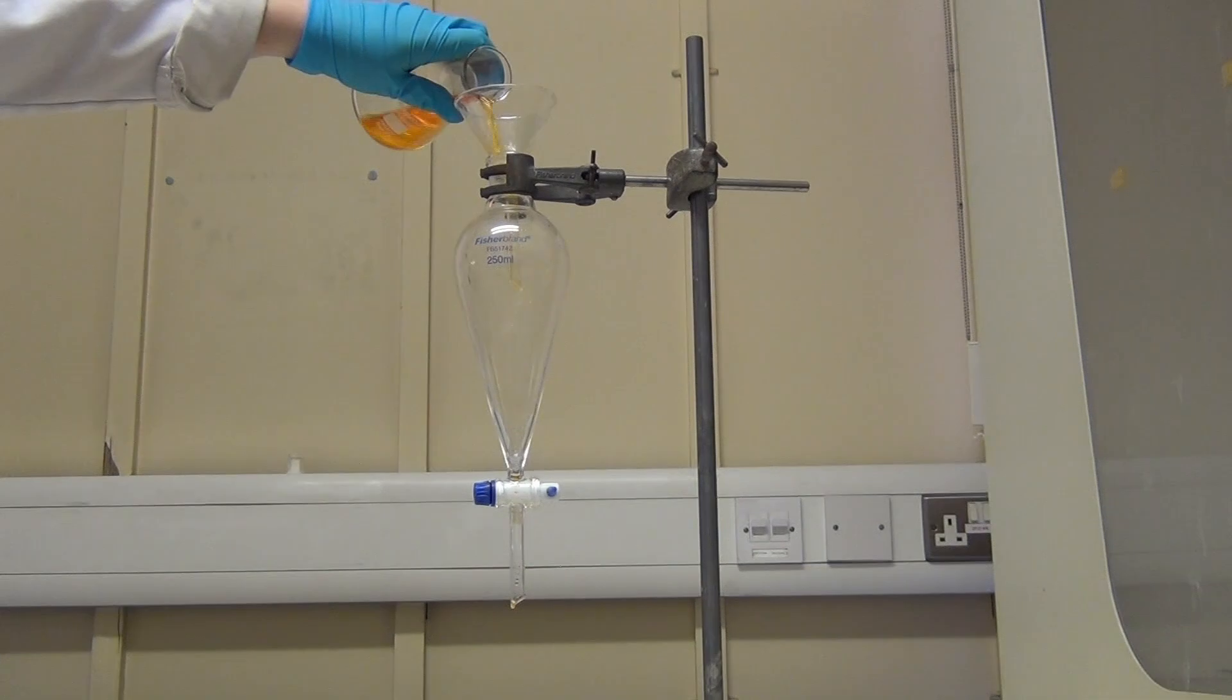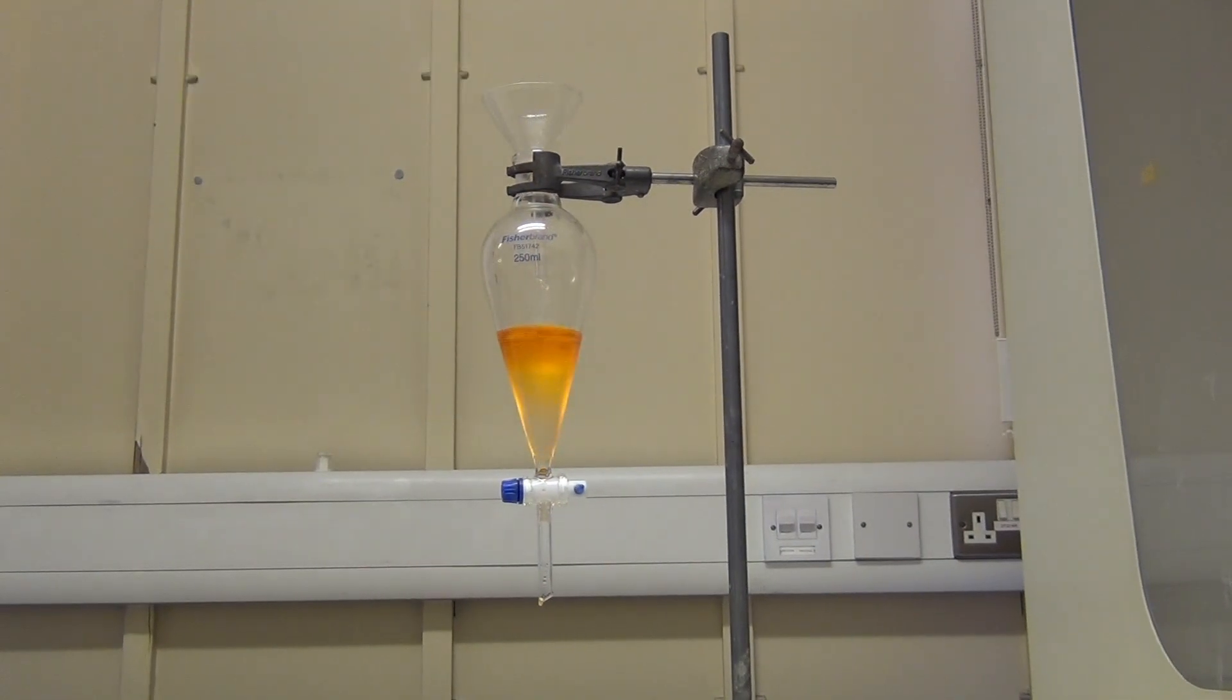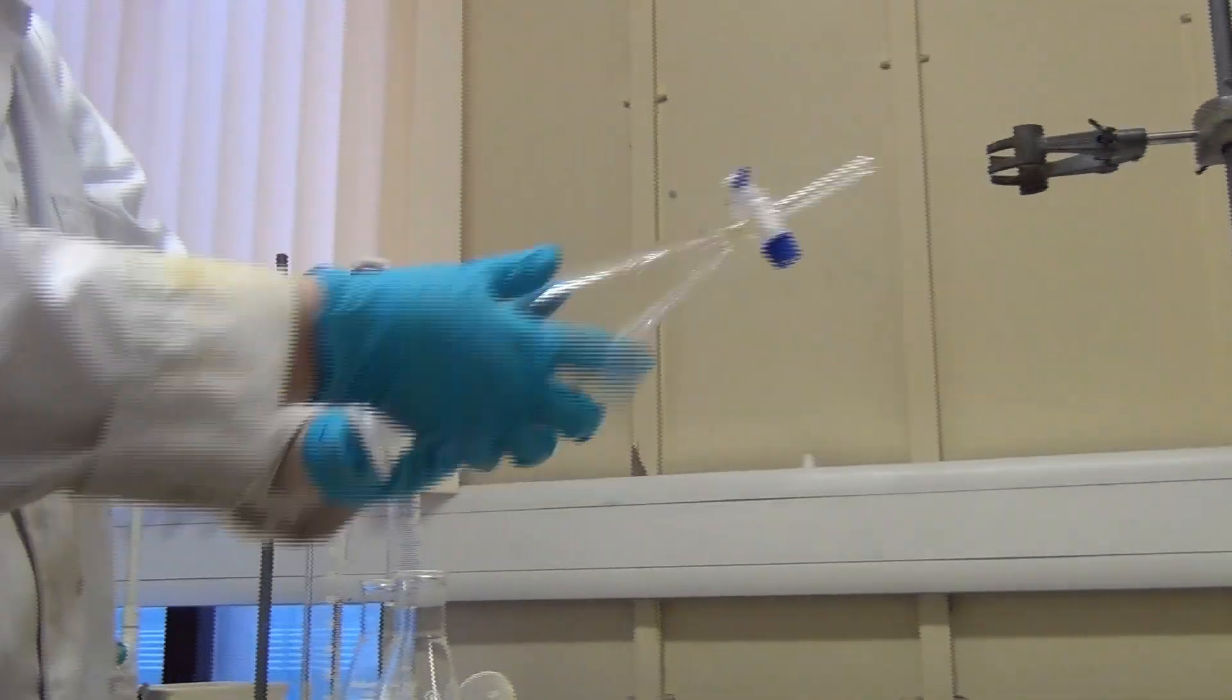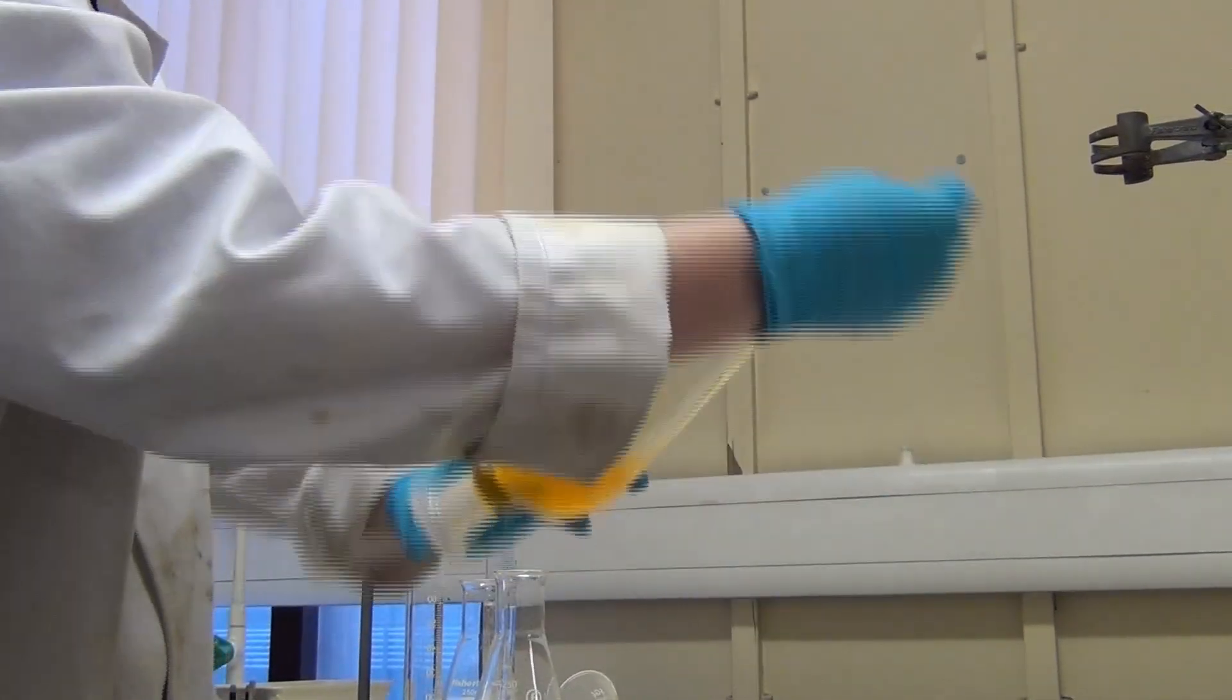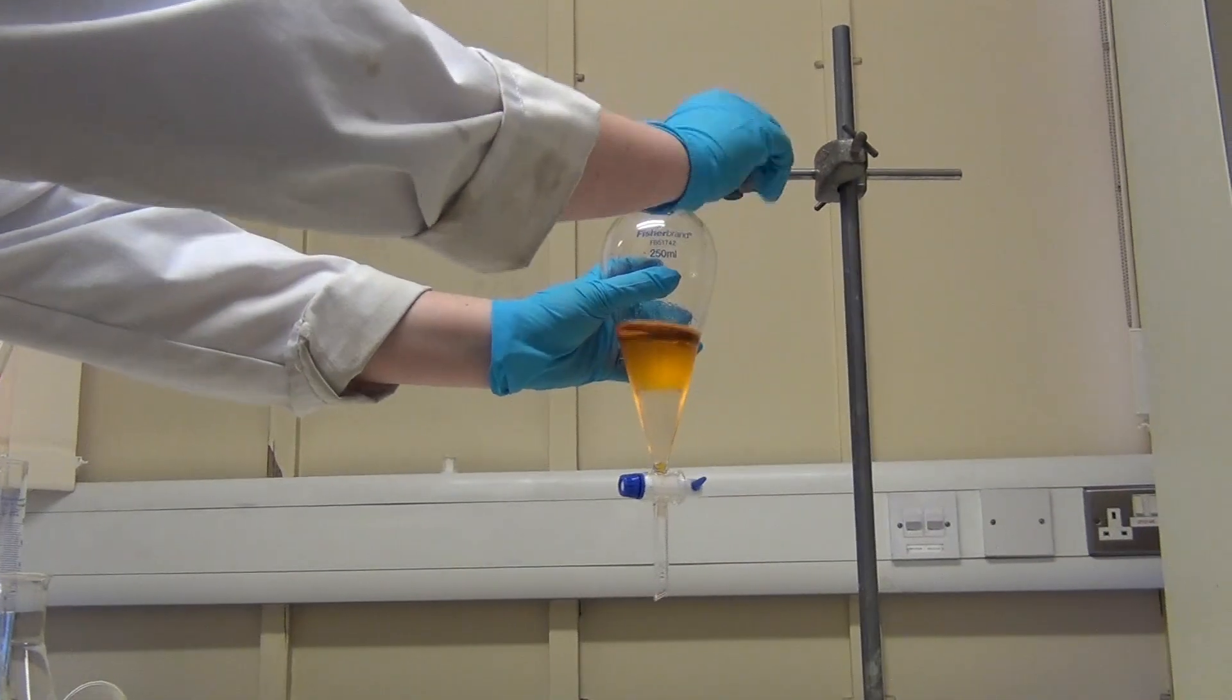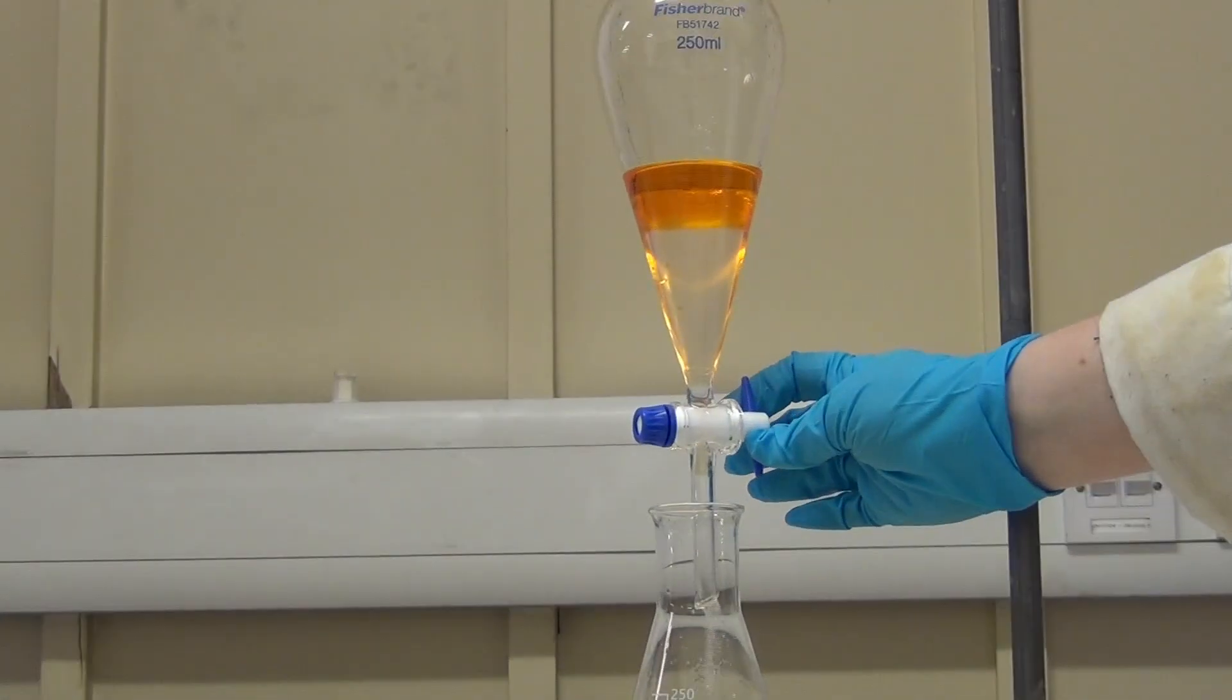To obtain the most accurate results, it is best to repeat the whole process twice more by pouring back in the layer you wish to extract more from. In this case, we want to extract the organic, orange layer, but this is not always the case. You add new extraction solvent from a measuring cylinder, not from the layer you have just extracted into a conical flask.